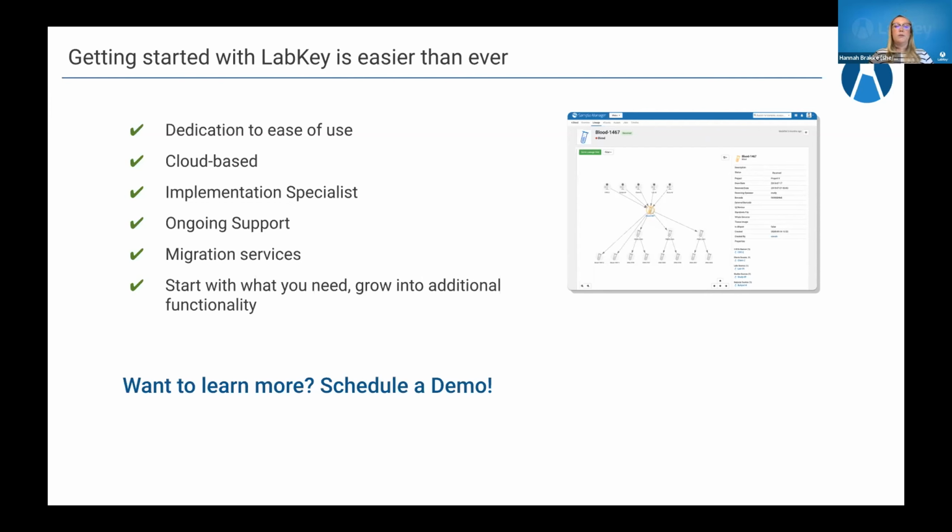And then really making sure that we're focusing on exactly what labs need right away and allowing you to grow into that additional functionality as your lab grows, as your needs grow, as your funding grows potentially, and you want to start tracking things in that digital space more and more.